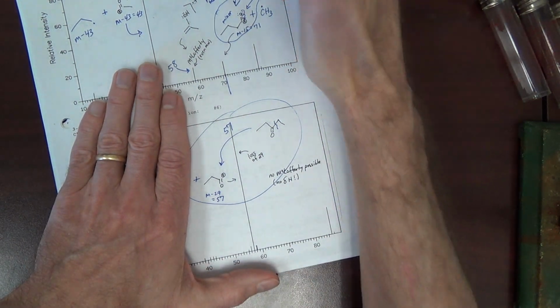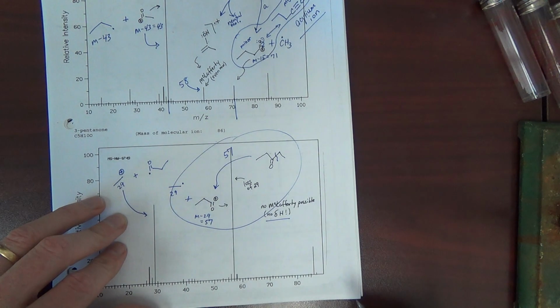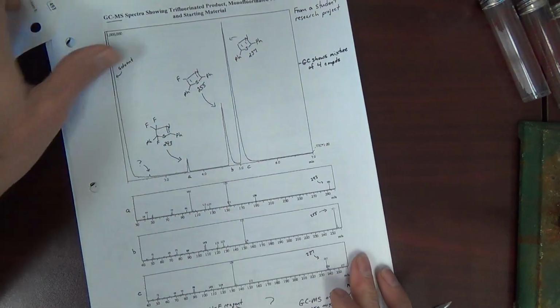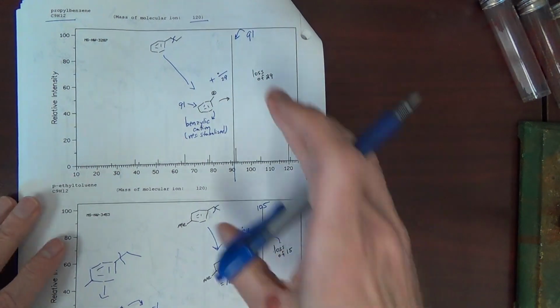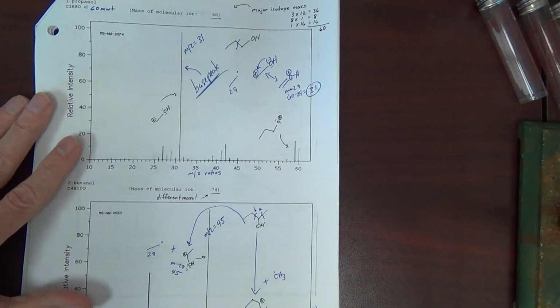Typically we want to predict with carbonyl compounds acylium ions. There's no McLafferty here, again, because there's no gamma hydrogen. So once you learn about that, you can see and confirm that there's not one here. It's going to be hard to confirm because you can't even hardly predict one. Okay, that's really the most common compounds. We've got carbonyl compounds. We have benzylic cations. We have these cations next to a lone pair, either like ethers or amines. We have isotope considerations. Back at the very original, we had cations next to oxygen lone pairs of an alcohol. We went back and we went through that.